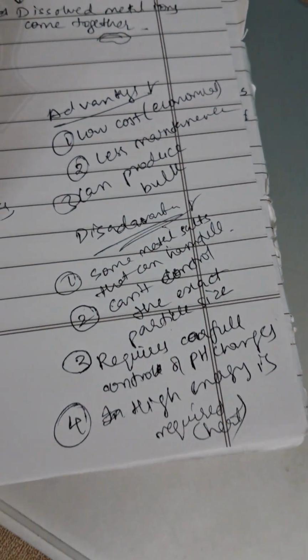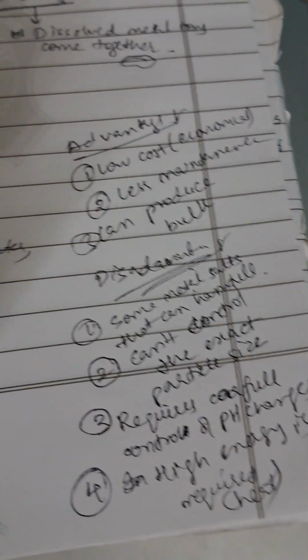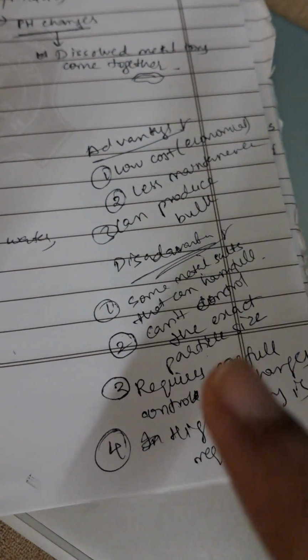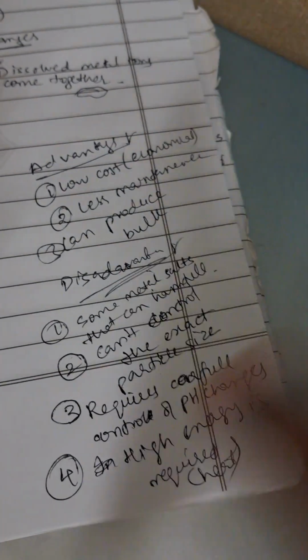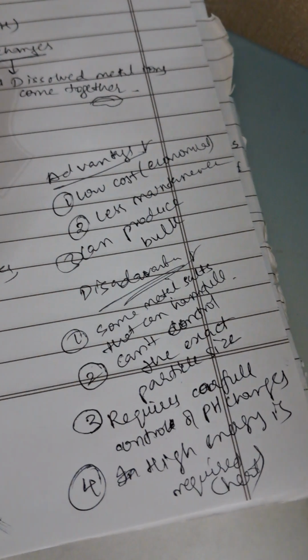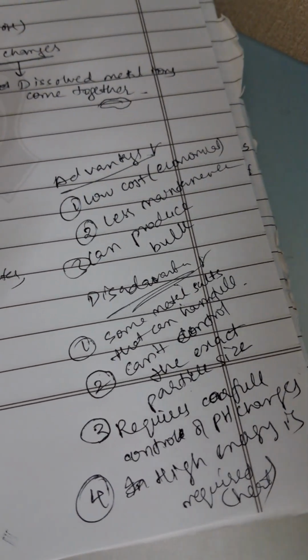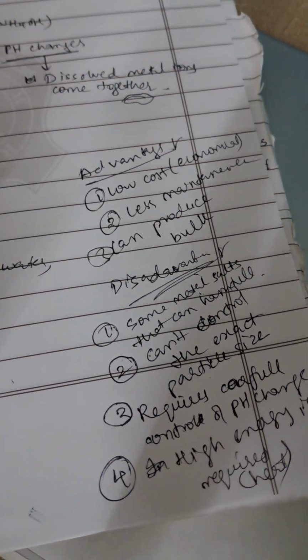Some metal salts can be harmful, but the advantages are low cost, less maintenance, and can produce in bulk. So step 1, metal salt dissolved in water to form metal hydrates. To these metal hydrates you add precipitating reagent and the pH changes to form metal hydroxide. Precipitate is formed, and by calcination, when heated at high temperature, metal oxide is formed, which is nanopowder. That's it. Thank you.